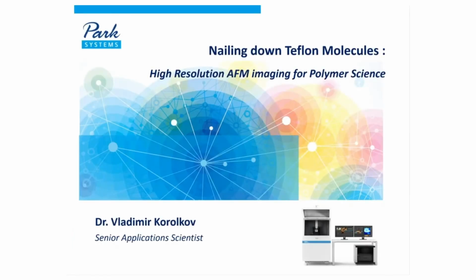This session will be split into two main parts. The first part will feature a special presentation on high resolution AFM imaging for polymer science. The second part of the session will feature a detailed demonstration of the Nano platform, where we'll briefly explain what the product is and then go into more of a live demo to show how it can help you and your research efforts. Then following all that, we'll have a Q&A session at the end.